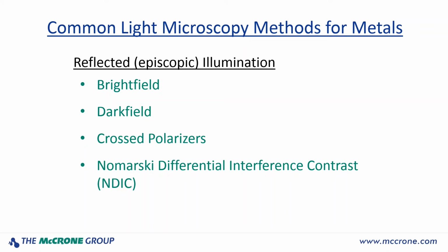Now, the bright field, dark field, and cross polarizers are probably the most common illumination methods you'll see in various publications and books and so forth. Nomarski is a little bit less known, but certainly not here. I use Nomarski quite a bit. I'll show you some examples of these various illumination techniques. I'm not going to go into a lot of detail about the setups for bright field, dark field, and Nomarski, and the microscope accessories that are needed. I'm just going to give you the practical uses of these illumination techniques.